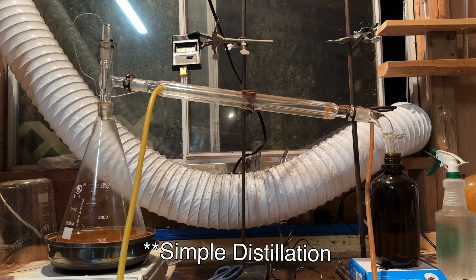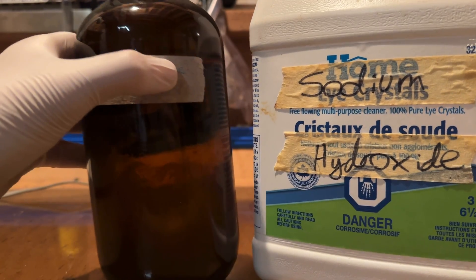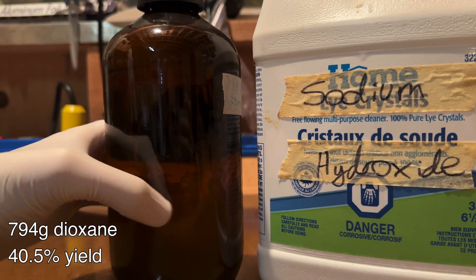Once again a fractional distillation apparatus was set up, and pure dioxane distilled over at around 101 degrees Celsius. In the end, 794 grams of dioxane was obtained, corresponding to a 40.5% yield based on the starting ethylene glycol.